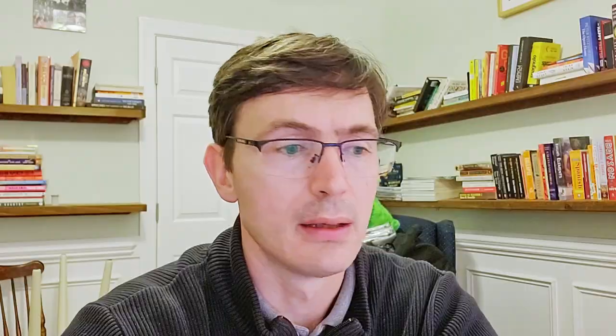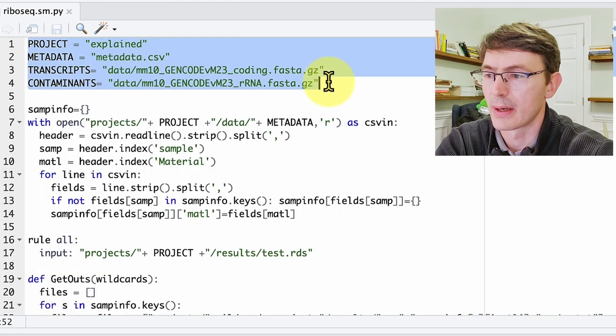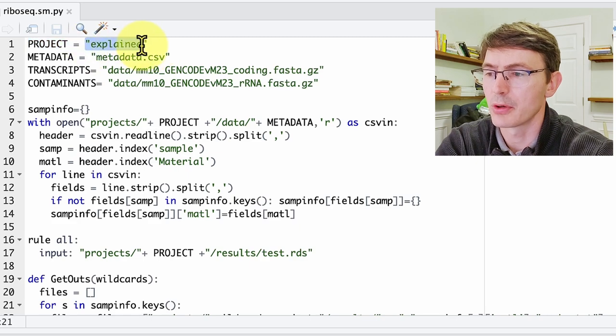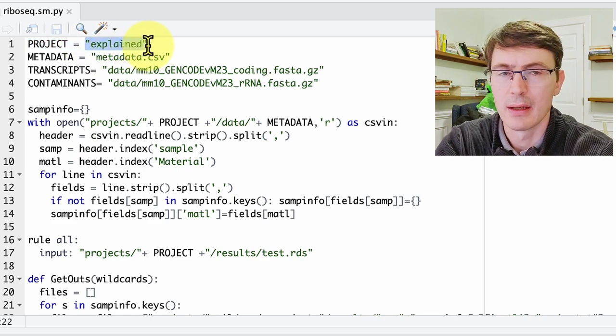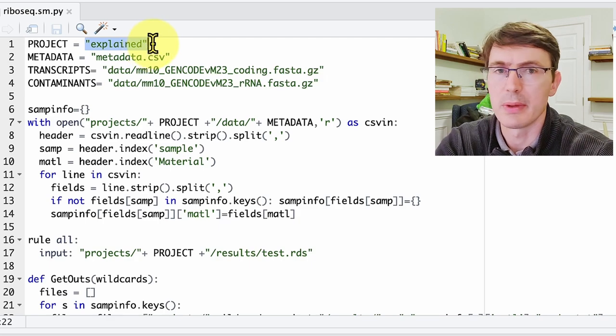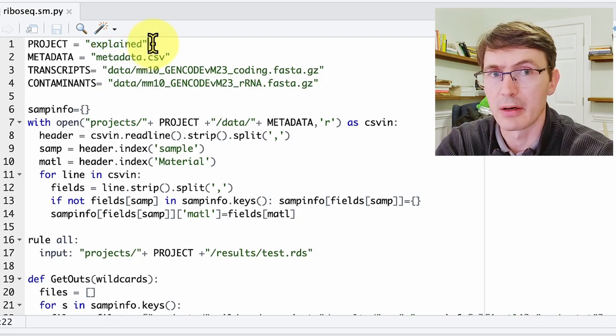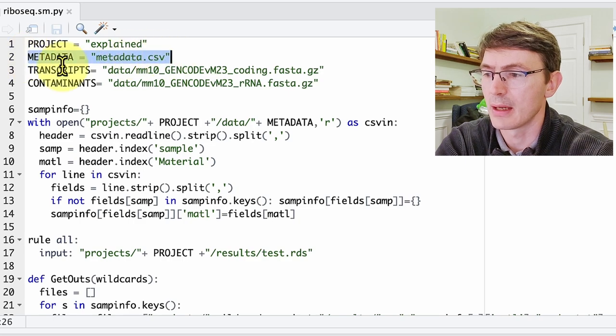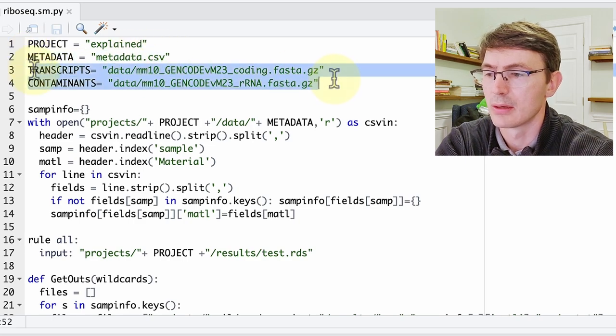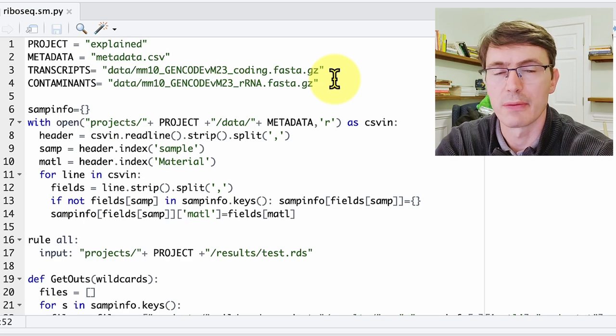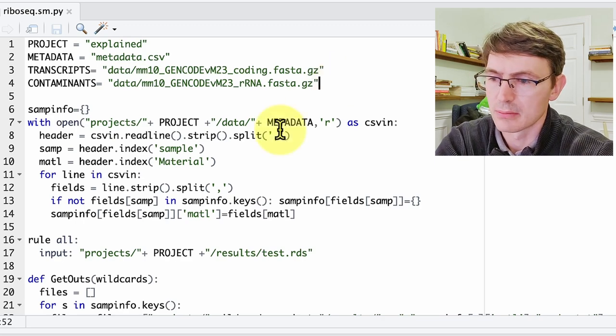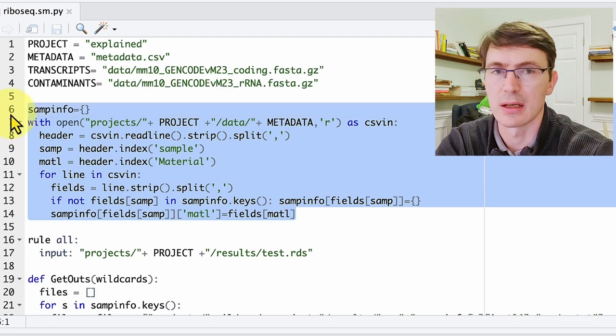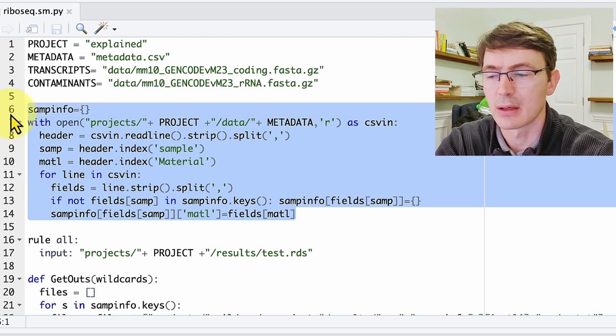Okay, with that out of the way, let's look at the script in detail. So we start with defining these parameters here. We give this variable 'project' the name of our project—in this case it will be 'explained'—and this is a normal variable that will be different to other types of variable that I will define in a second. Then we give the name of the metadata file and the position of the transcriptome sequences to which the FASTQ will be aligned.